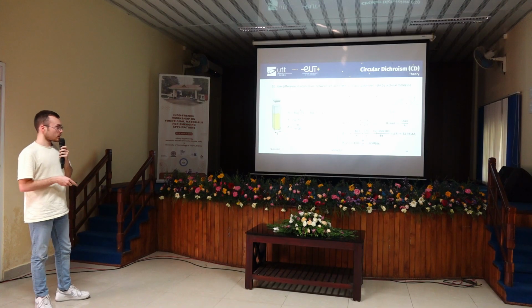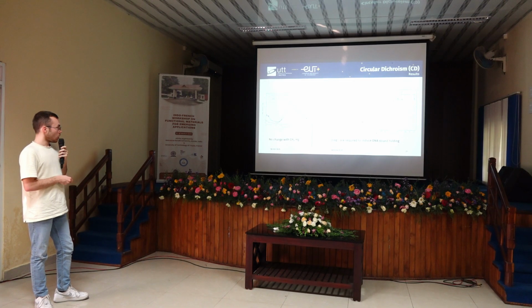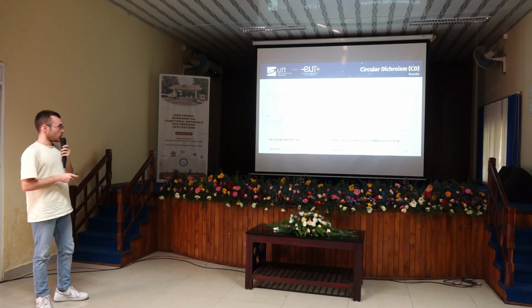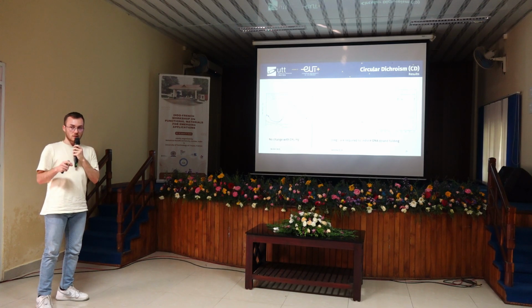So here are the formulas, and we observe this. So the dotted line is the solution of only DNA. Orange one is a mix between DNA and methylmercury, and we observe no shift of the signal, so we don't have the modification of the morphological aspect of DNA. However, in the case of mercury cations, we have a shift, so we confirm that we have a modification of the shape of DNA.